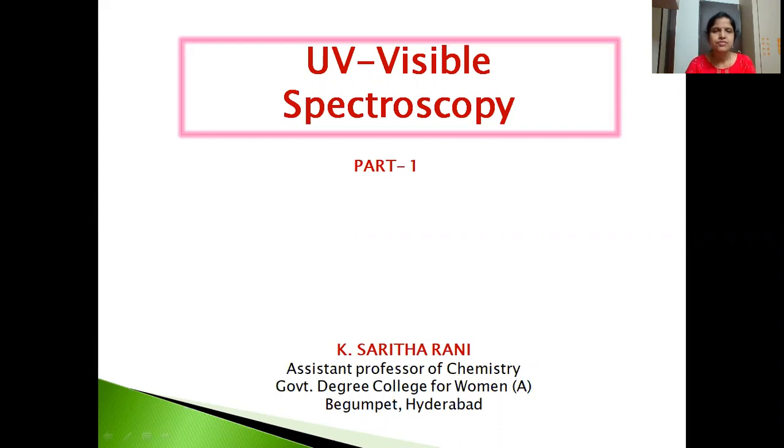In our last videos, we have seen what is spectroscopy, and we have also discussed IR spectroscopy, the principle of IR, the instrumentation part, and also its applications. Now, in today's class, let us discuss another type of spectroscopy, that is UV visible spectroscopy.